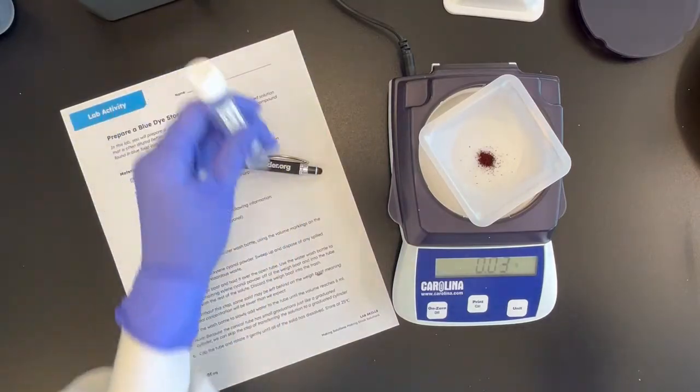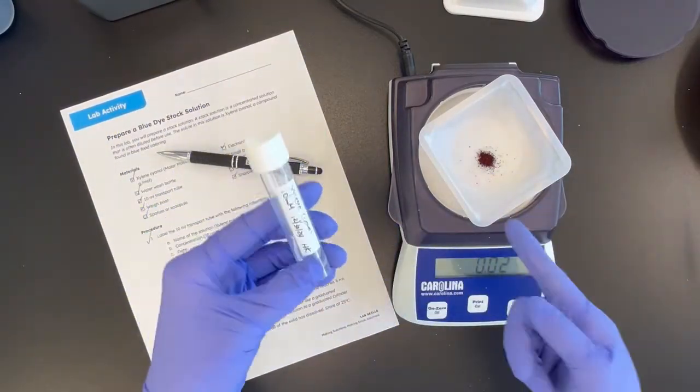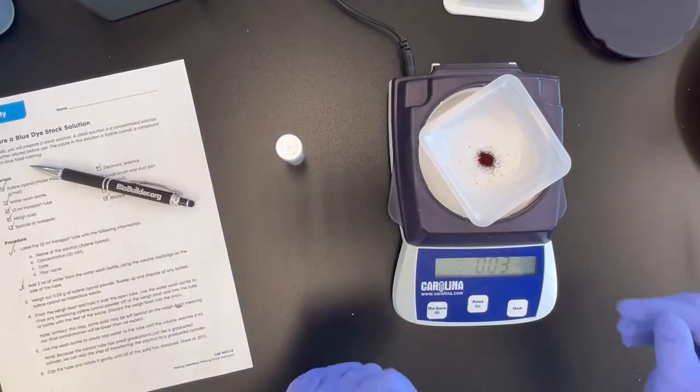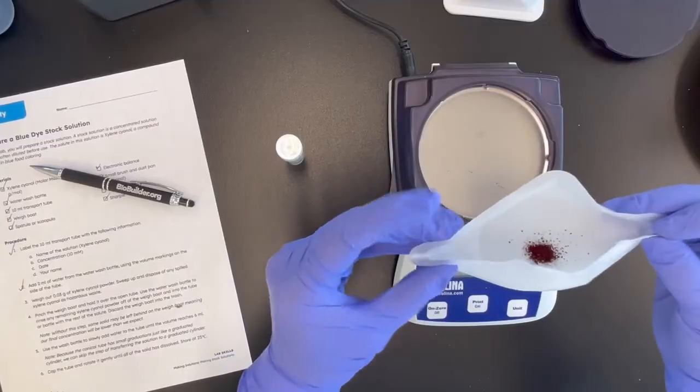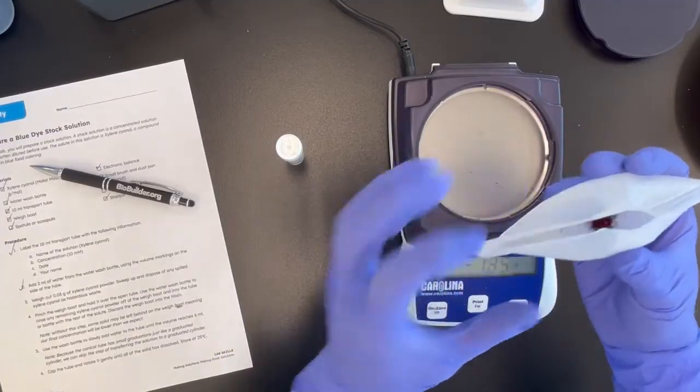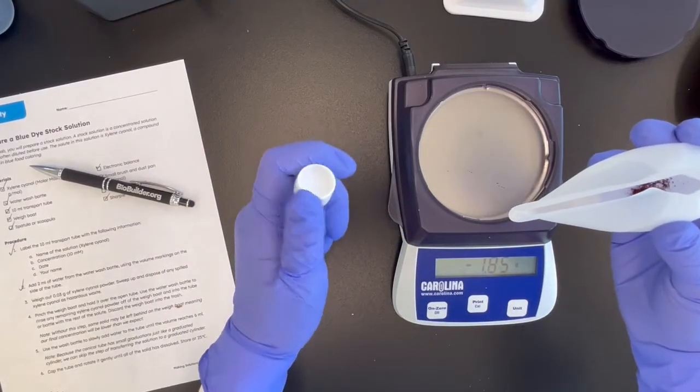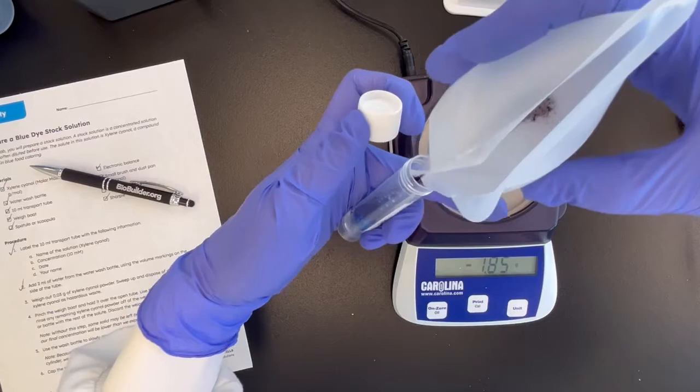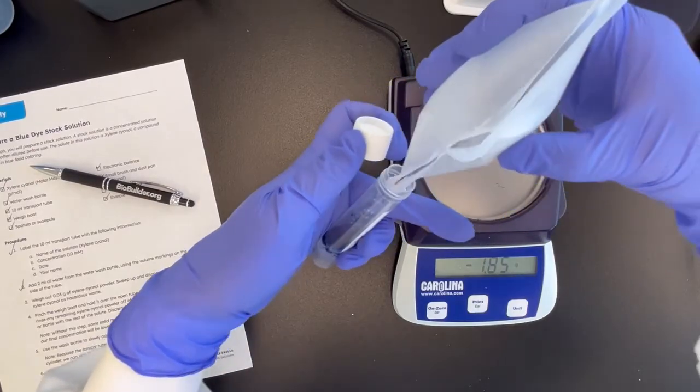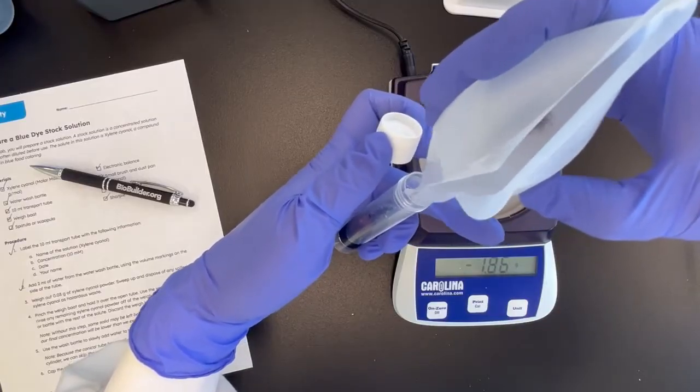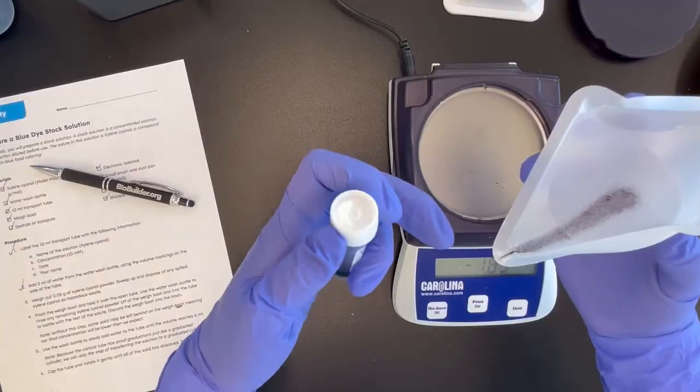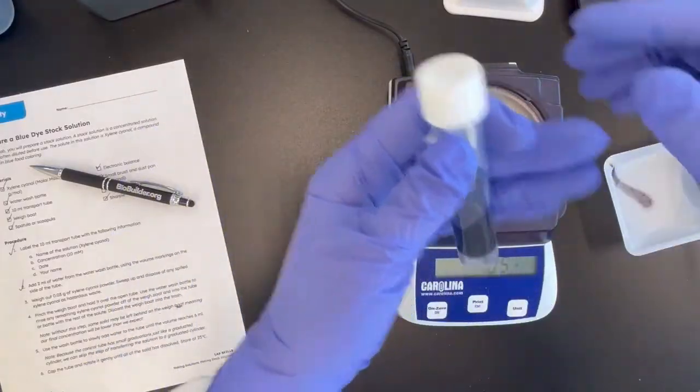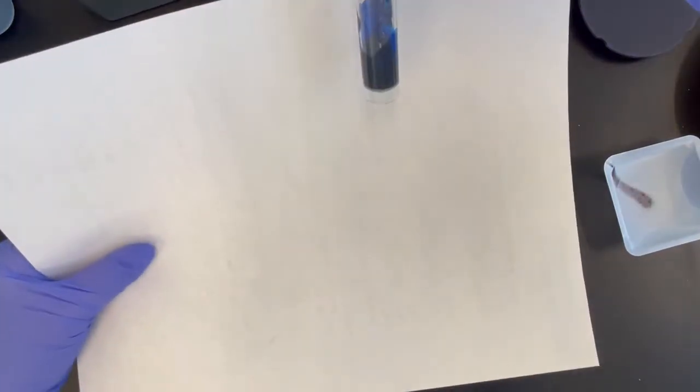So now what you want the students to do is to transfer the powder into this tube that has two milliliters of water. And to help assist doing that, these weigh boats can be bent in diagonal like this. And so this could be used as a spout to drop the powder in. So here we go. And you can have the students just kind of gently tap to make sure you get all the powder as much as they can. And they can close the cap for now. And you can see that it's immediately turning blue.